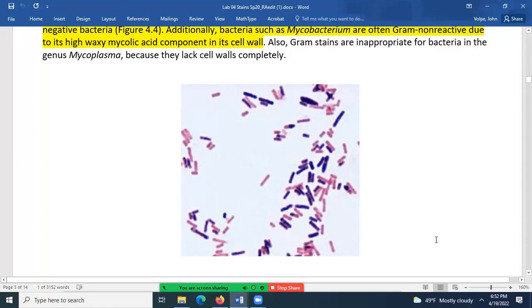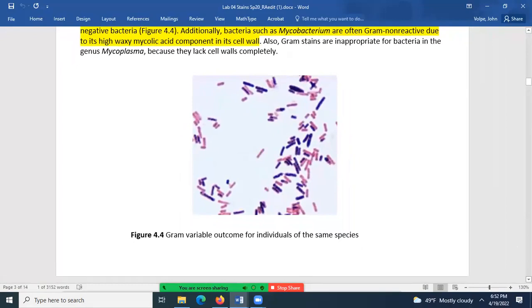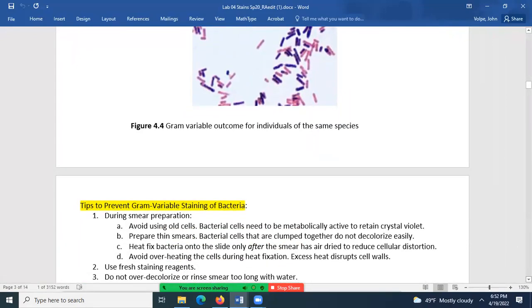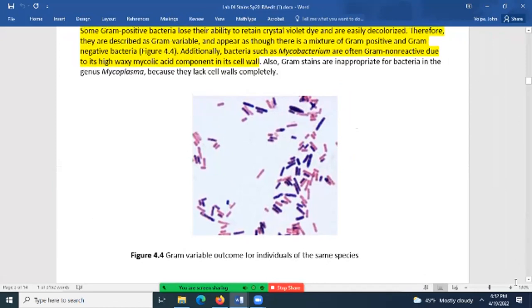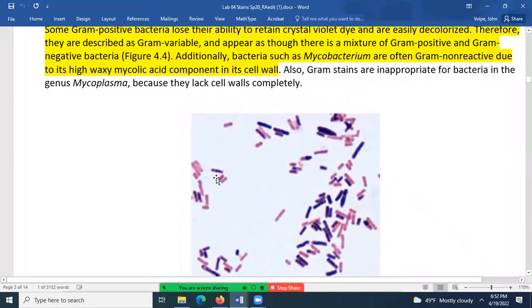You guys will have to figure it out on your own. Is there no difference? No, there's a difference. You don't see a difference between this cell here and this cell here and that cell? Oh, just the color? No, a difference in something other than the color. The cell shape. The shape, the texture.